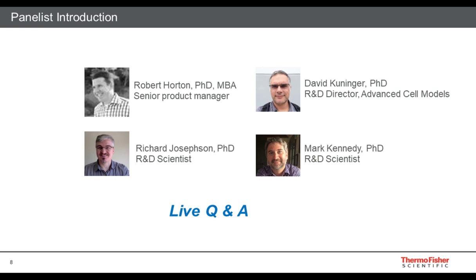Great, thank you. All right. A question around your experiences with kidney organoid cultures, and if you ran into any problems or challenges when growing kidney organoids. I've done iPSC-derived kidney organoids once in the past. There are a few similar but different published protocols out there. The ones that I've tried actually worked pretty well.